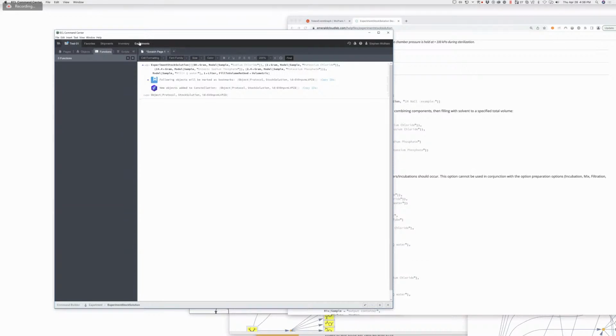Oh, I'm still admiring this. Okay, so let me just understand. I've got 80 grams of sodium chloride, 2 grams of potassium chloride, and this is just combining together with dibasic sodium phosphate, whatever that means, and then a liter of water. You're going to make a liter of it, and you're going to fill the volume, so you end up with exactly 1 liter of that solution at the end of the day. So it's going to put the solids in and add enough water to get to 1 liter.